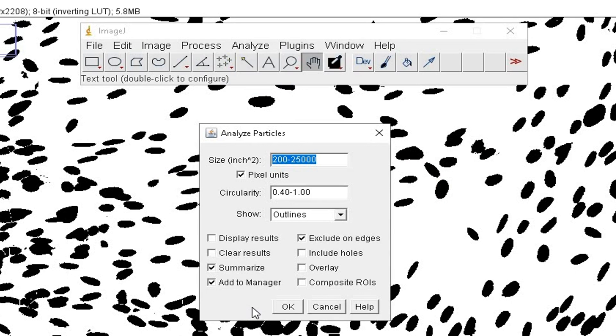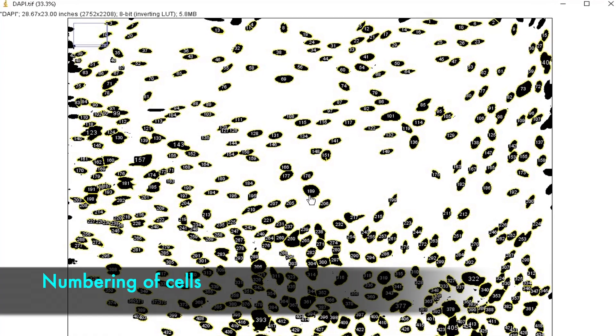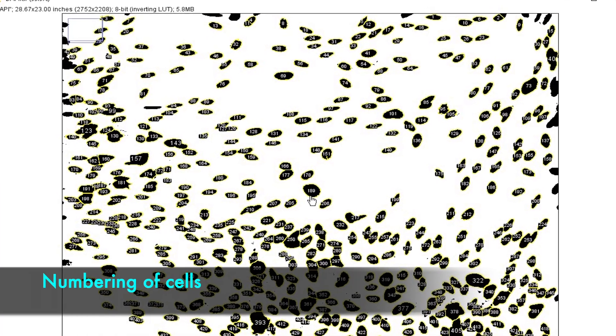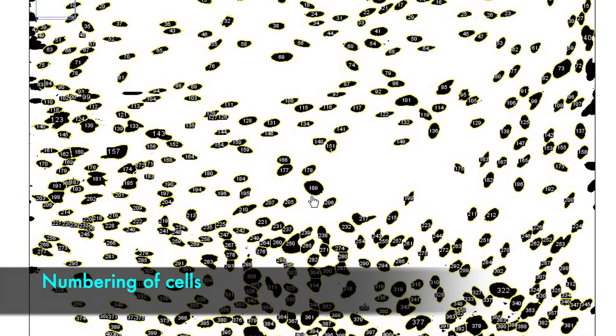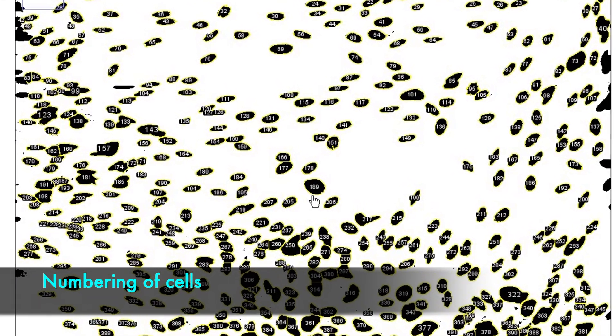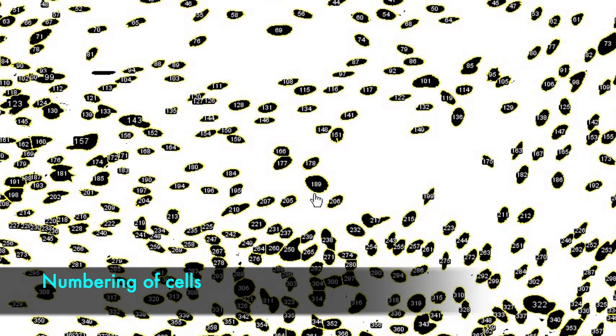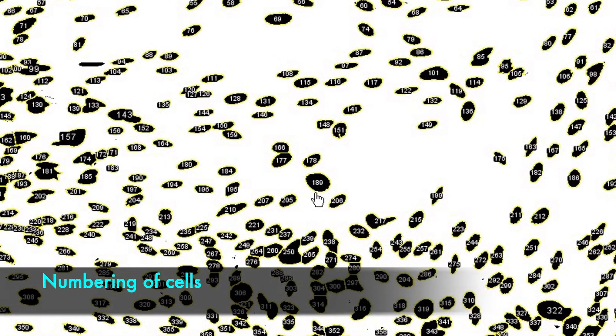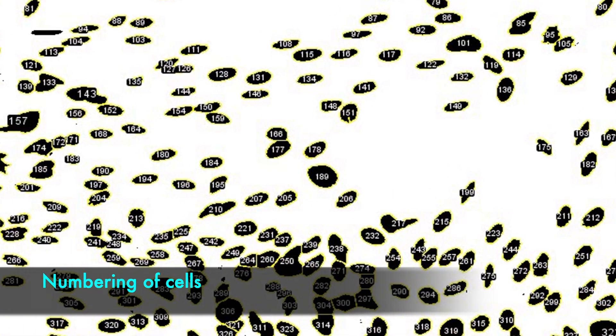In this dialog box, check on the Add to Manager option, and click OK. This step converts the watershed image cells into cells that are numbered. For example, this cell has been numbered as 189.